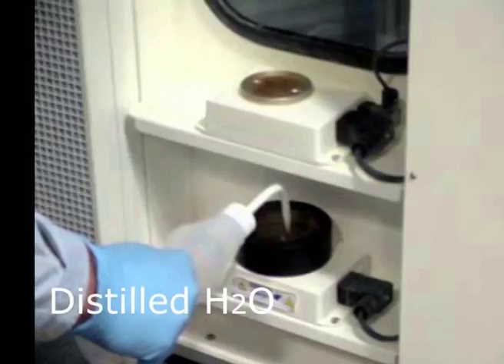After a few minutes, latent fingerprints begin to appear. The object is exposed to the fumes till maximum contrast has been achieved between the prints and the background. The developed fingerprints are immediately photographed.